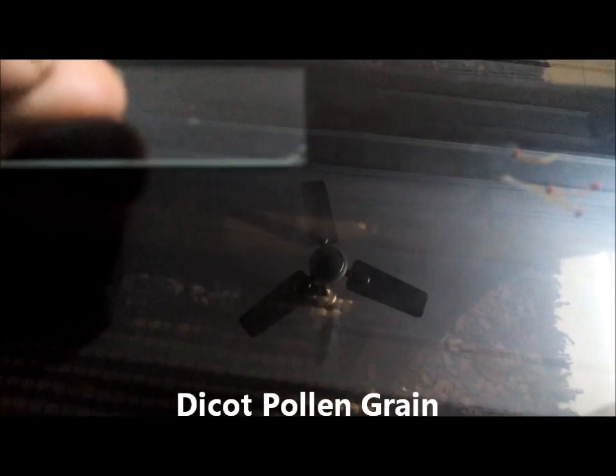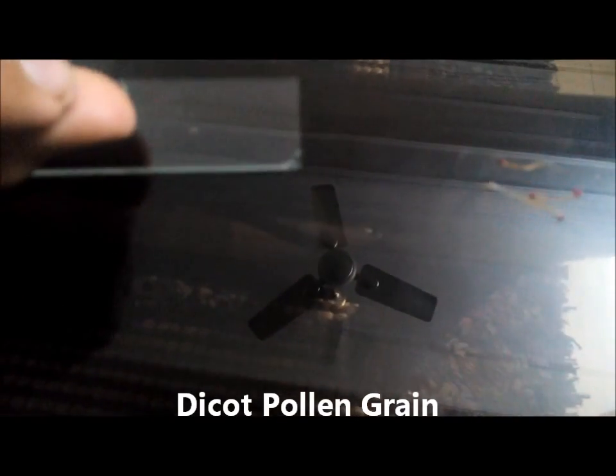So let's start with the dicot one first. So I will prepare a slide. I will just burst open this anther to expose the pollens.